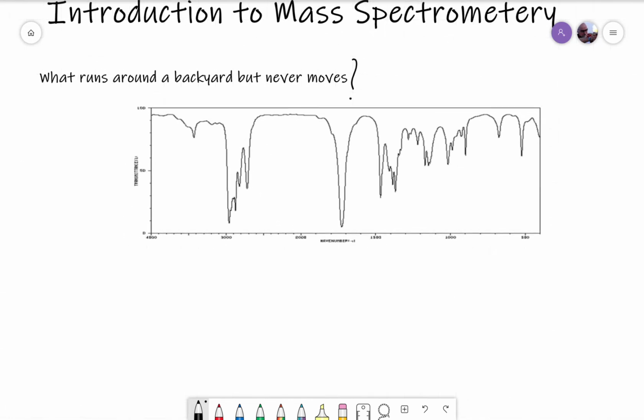Okay, in previous lectures, we have been discussing how to obtain structural information and actually draw Lewis structures given IR spectra. But consider all of the problems that we were given. We were always told what is the empirical formula of the molecule or given additional information. Consider if you were just given this IR spectrum and told to draw an explicit structure based on that IR spectrum. Now, it's true, you may be able to obtain some structural information.